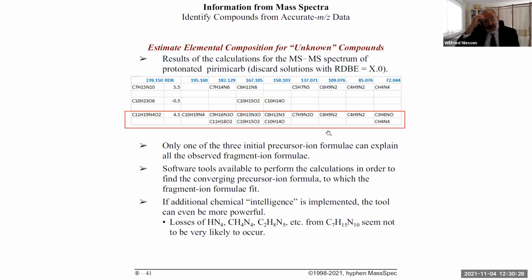And you realize that in some cases, especially when you do ion trap fragmentation and you might have these adducts, these things might go a little bit wrong. There is software available with the instrument software from various instrument manufacturers, which performs this calculation, which I now did as part of an Excel sheet.